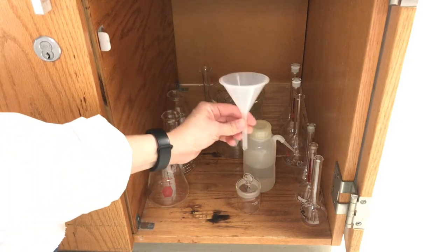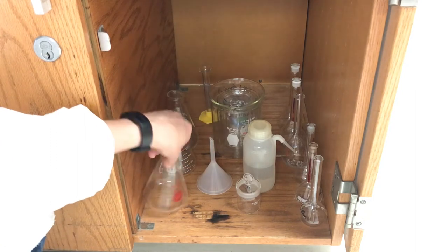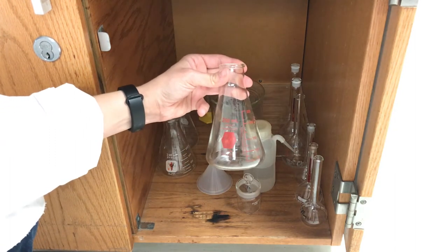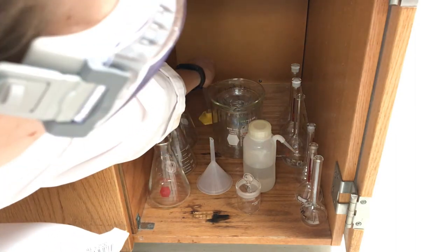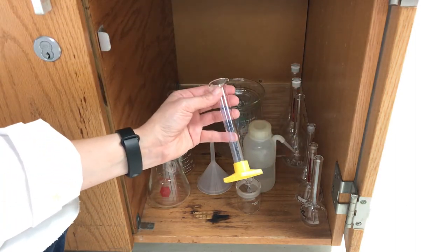You're going to have a funnel either glass or plastic. Three Erlenmeyer flasks either 200 or 250 milliliters and a 10 milliliter graduated cylinder.